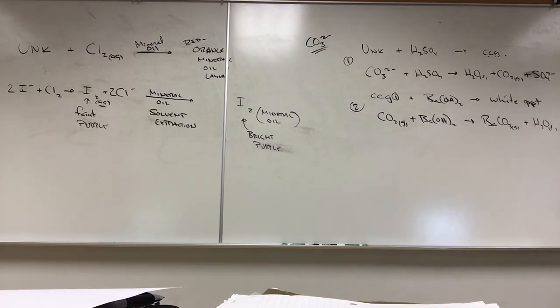And so we have this Lewis acid, but the way we're going to do this is kind of funny because we're going to generate the CO2 gas. So as the CO2 gas rises, let's say this is the test tube, we're going to hold a dropper that has a half drop of barium hydroxide, aq, suspended on the end of it. And so as the CO2 gas hits the surface of that, we should see a white precipitate or white film form on the surface.